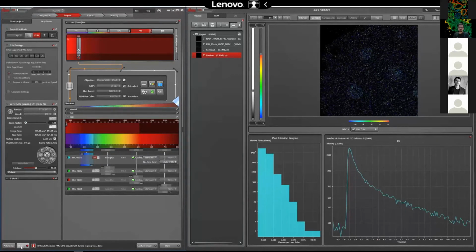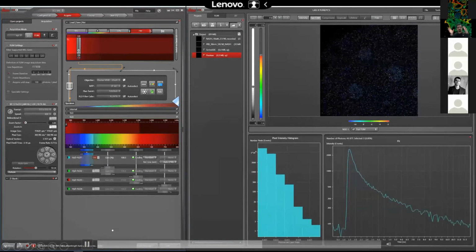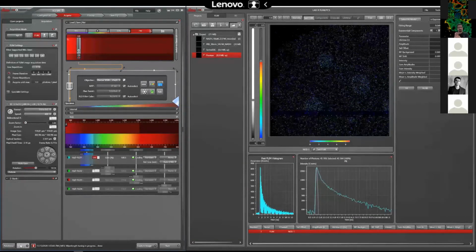So what we would like to do is to look at the metabolism state, but looking at the cytosol, we are not really looking at single mitochondria. So that's why I think that 300 nanometer pixel size is a good compromise. To have the proper size for the field of view, to have 2 or 3 cells in a field of view, as well as to not have a terrible resolution. So the images have enough spatial information, as well as that we would be fast enough to get enough temporal resolution.